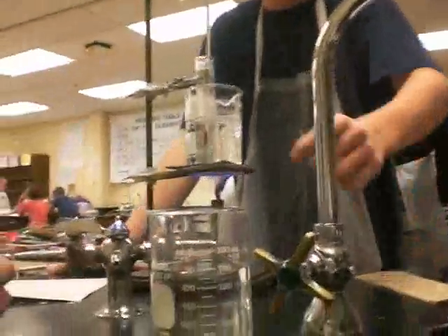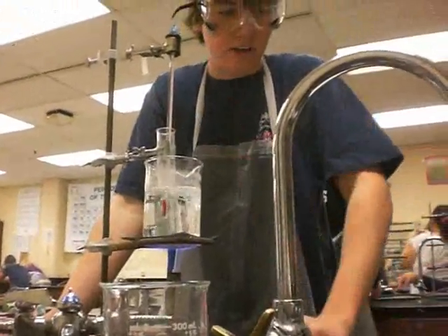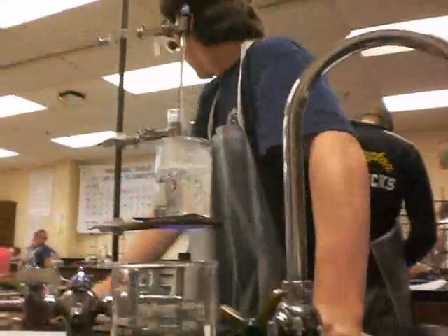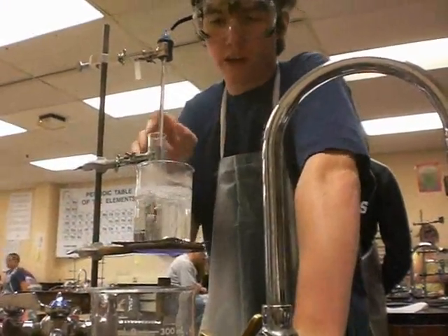What you saw here — we had a short picture that came over. We took the acid from here and put it in here and cooled it. This is 30 degrees. And basically we tried to turn the liquid acid into a solid.